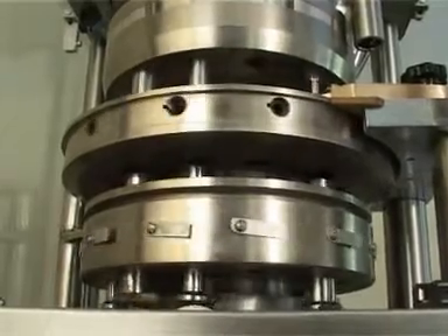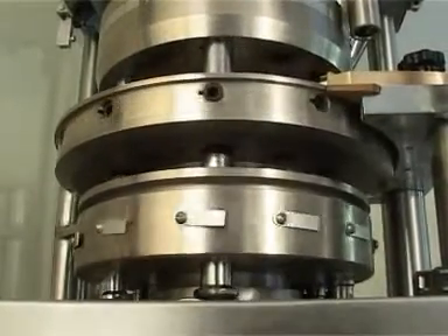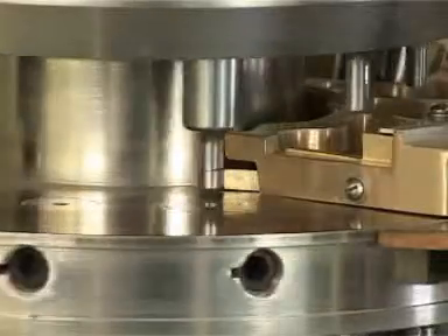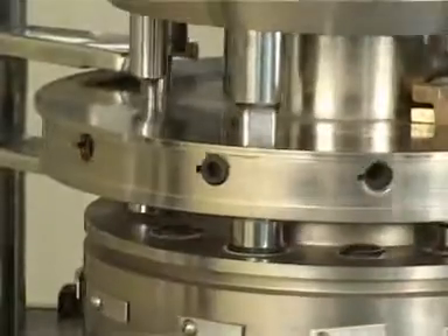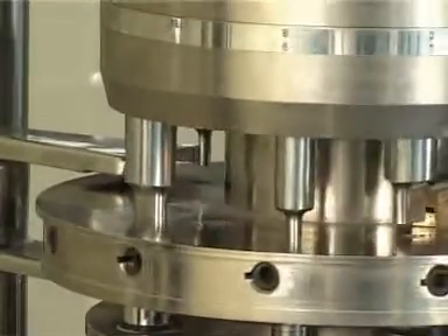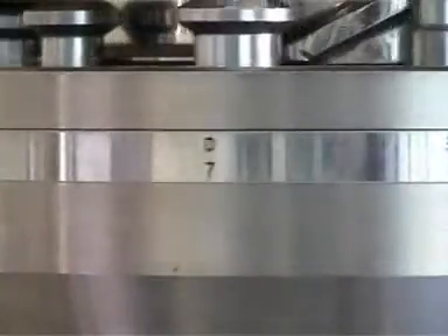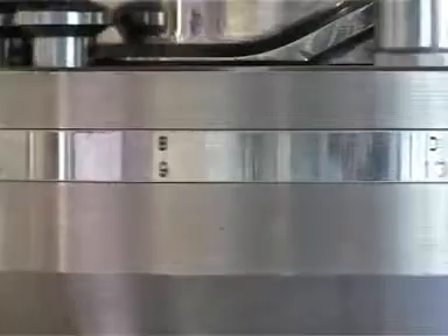On top of it all, it comes in three variants: Standard, Multi-Tooling, and Senseforce Instrumentation Monitoring System. The machine shown in this video is a 12-station multi-tooling configuration, i.e., 4 station D, 4 station B, and 4 station BB toolings are there in the turret alternatively.